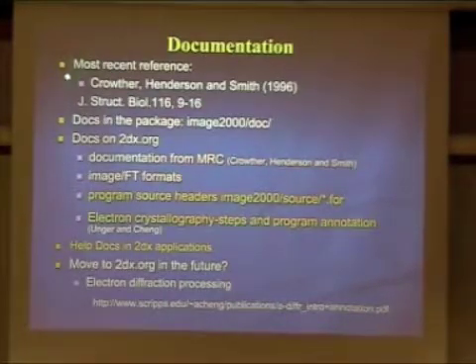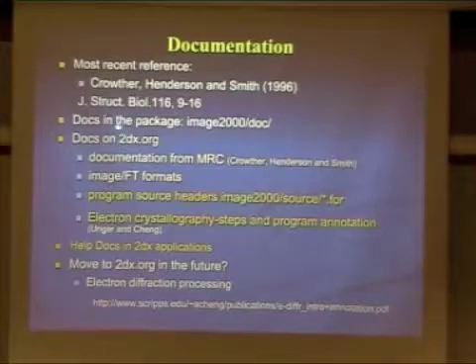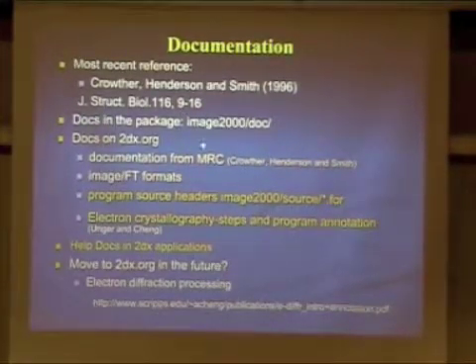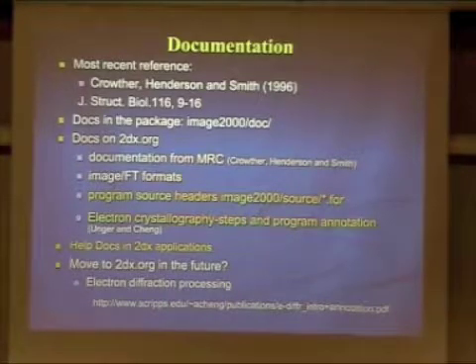The most recent reference, if you need to reference the package, is still the 1996 one, where they describe the whole package. There is documentation with the package if you download it. And Henny did a great job consolidating the available documentation at 2dx.org. That would be a good place to find all sorts of information.